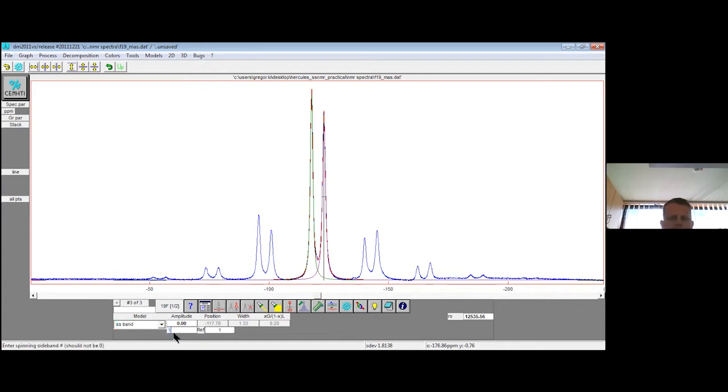And then we have the amplitude. So I will say rank 1, and then we have the amplitude, because if it's 0, we will not see the line. But if we put something different from 0 and then push this button to calculate, okay, the line appears in here. It's a little bit too small, but DMFit will be able to figure out the proper intensity. There's another box which I've mentioned before. There is rotation frequency, and it's in bold font. So we will change rotation frequency as a parameter during fitting.